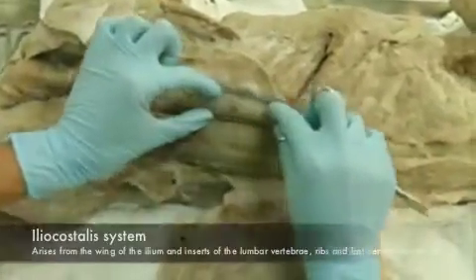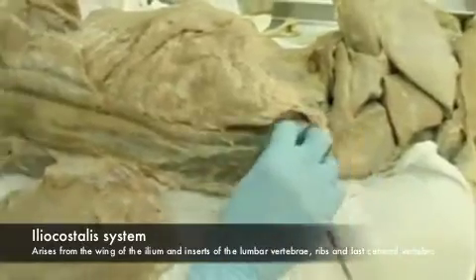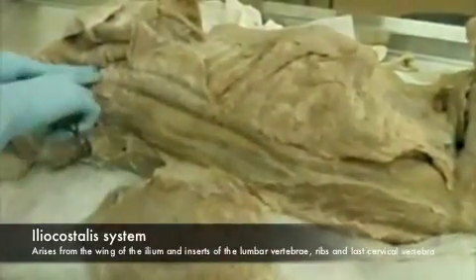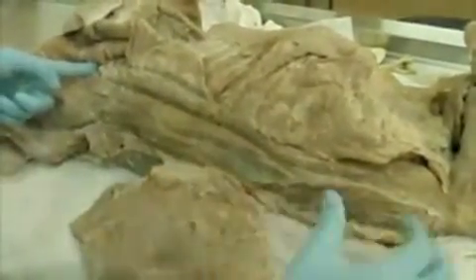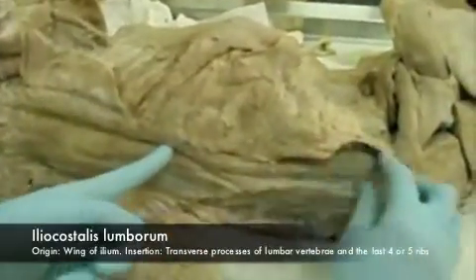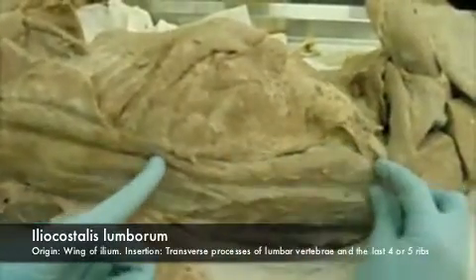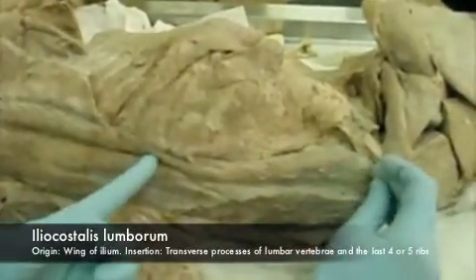So the iliocostalis system spans from the length of your ilium all the way to your thorax. It has 3 parts. The lumbar part, which is your iliocostalis lumborum.